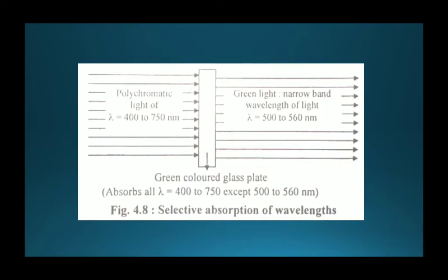That means absorption filter kya karta hai? Ke sirf desired wavelength ki radiation usme se pass hone deta hai aur baaki remaining radiation absorb kar leta hai.